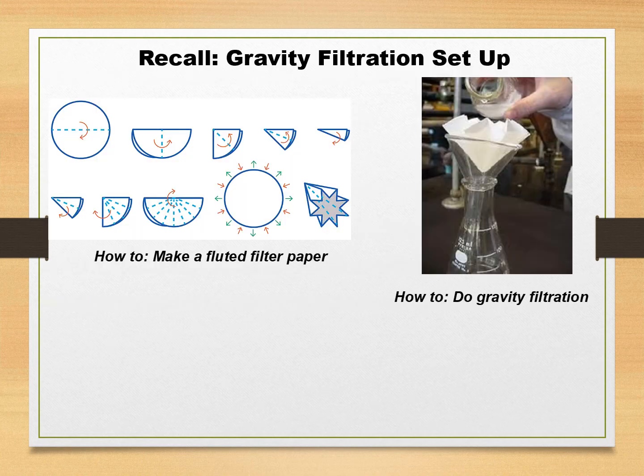Next procedure will be to purify the benzaldehyde from any humidity which may come from the water, and to do that we will filter and dry it using magnesium sulfate. So magnesium sulfate is a dehydrating agent, so when we add from 0.5 to 1 grams of magnesium sulfate, it will absorb any remaining water droplets.